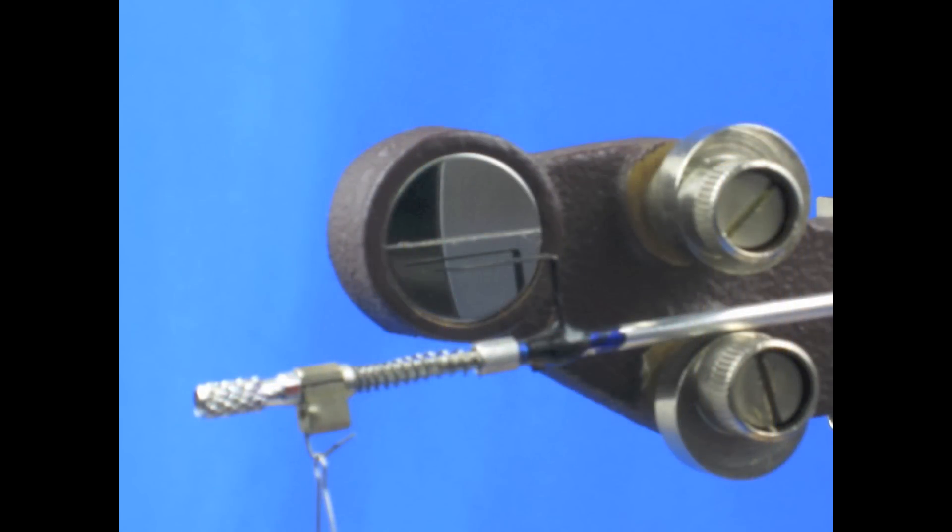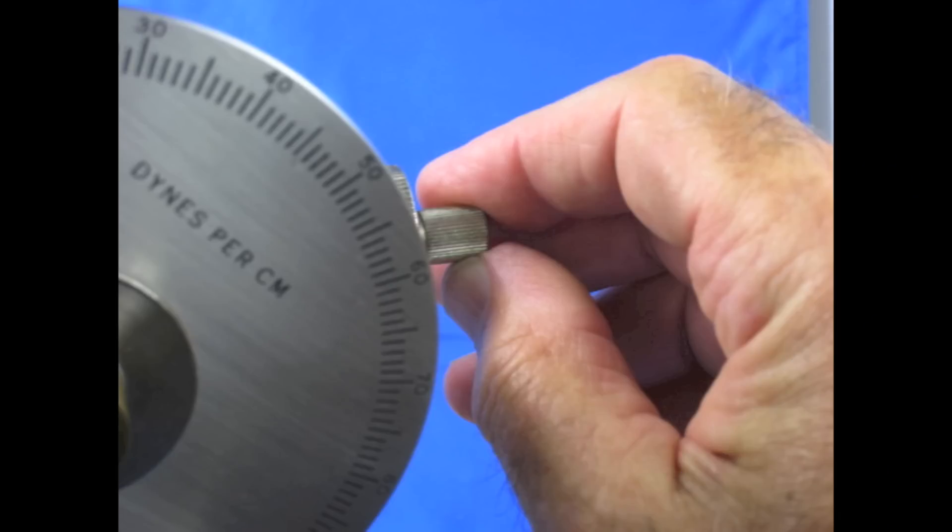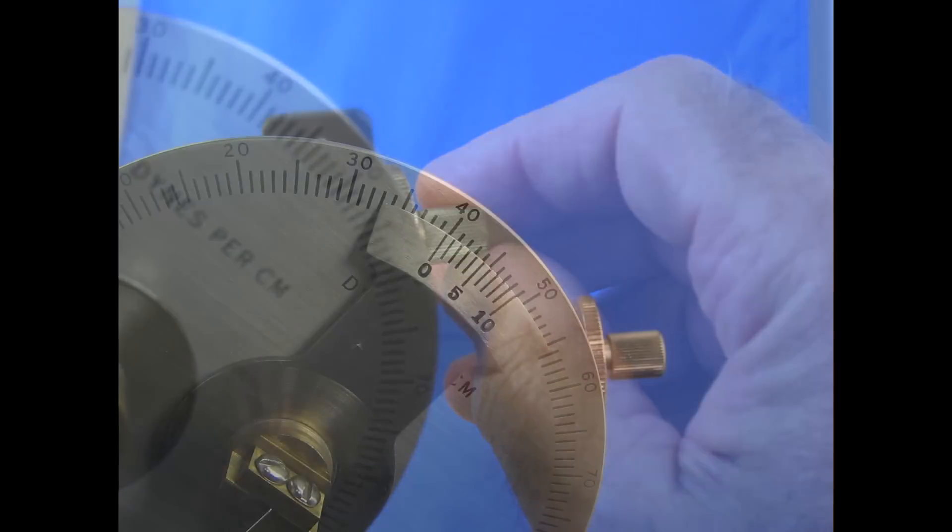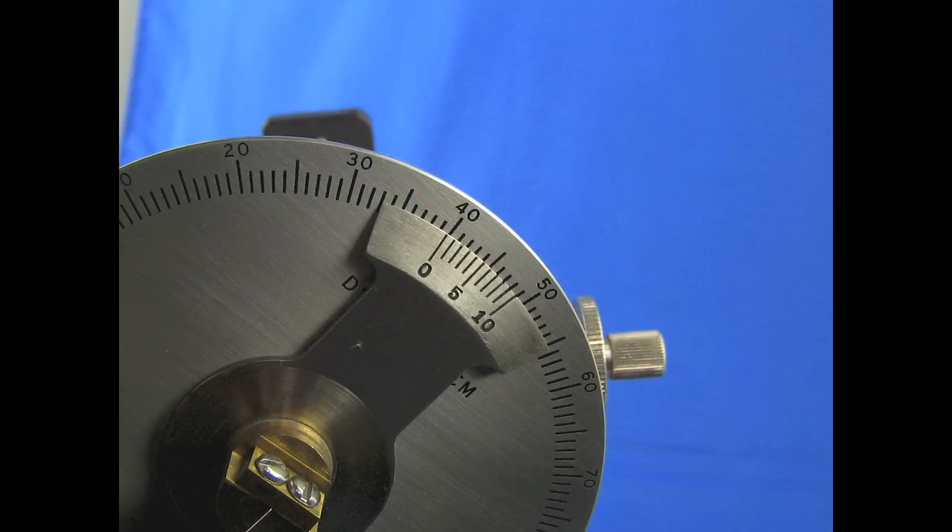This will again pull down the torsion arm, moving the pointer below the mirror line. Again using the adjustment knob, move the pointer back up to the mirror line. Now read the dial where the vernier line matches and record the dial reading.